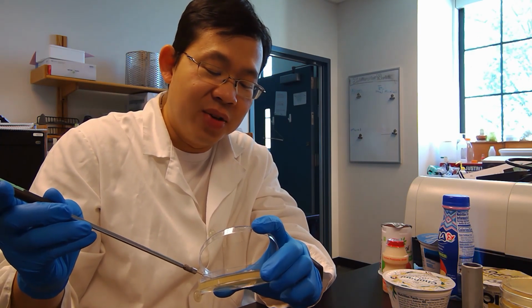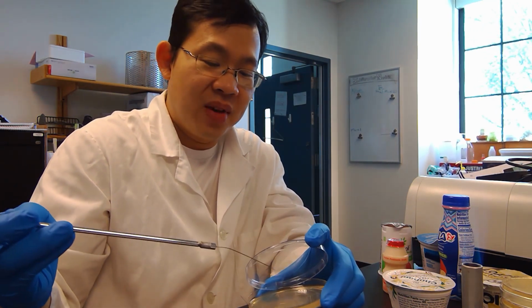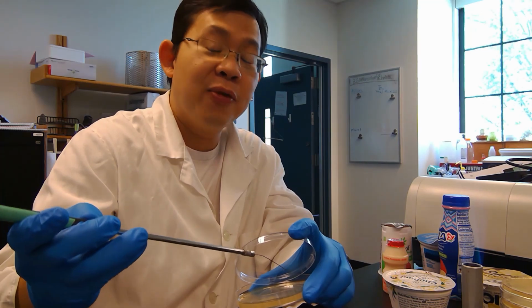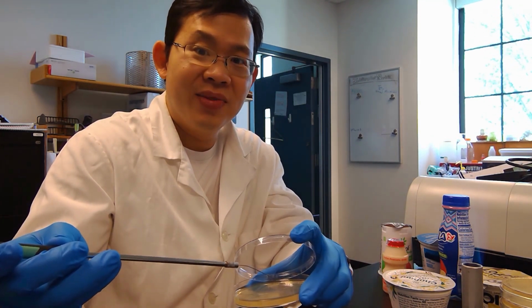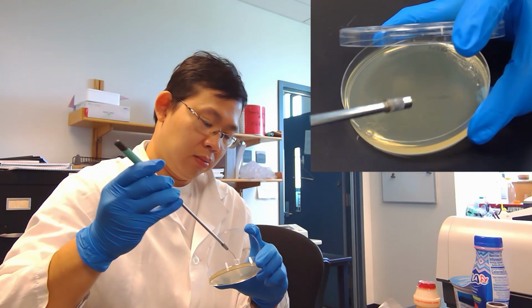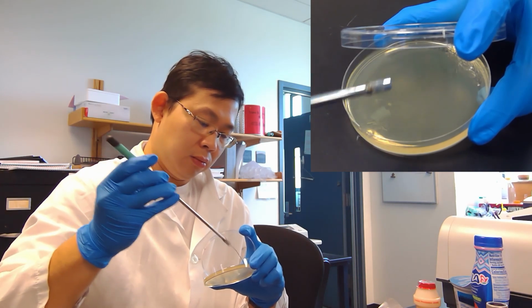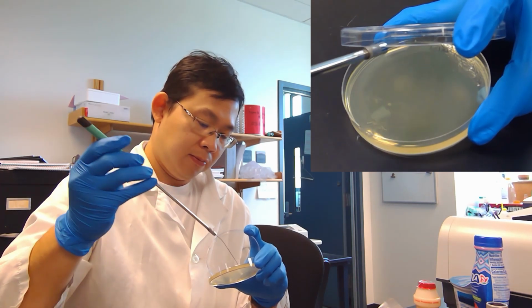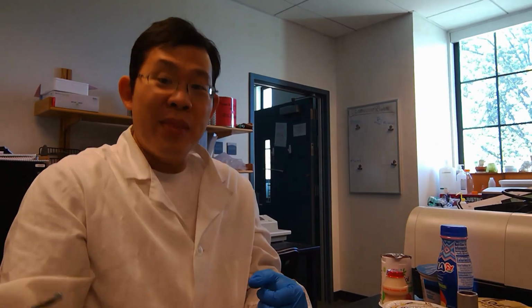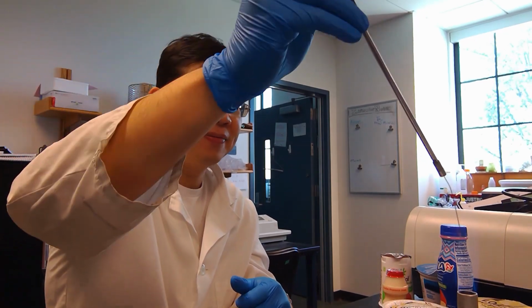And when that happens, you know your loop is cool enough, and you can use the loop to drag some of your sample from quadrant 1 to quadrant 2. Okay, here we go. Alright, so we made our quadrant 2. We're going to continue to quadrant 3, but don't forget to always sterilize your loop before making the next quadrant. Okay, here we go.